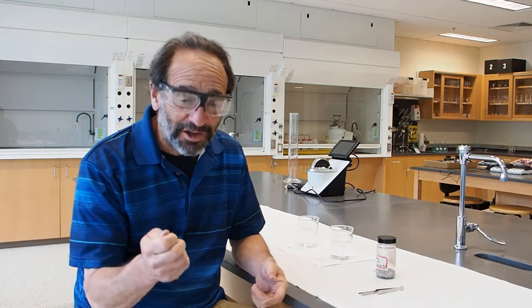Okay, so we're ready to start looking at the dissolution of metals. As you know, metals don't generally just dissolve when you put them in water. You take a spoon, you put it in water, even hot water, and it's still a spoon. It doesn't dissolve. What we're going to be looking at is the degree to which you have to use other chemical entities to try to get the metal to dissolve. And it turns out some metals do dissolve, and we'll look at one of those first.